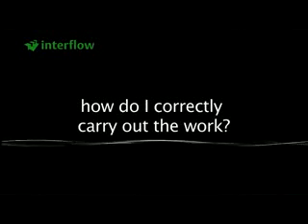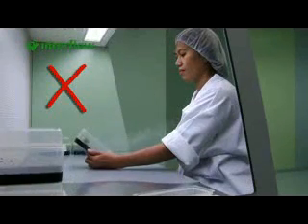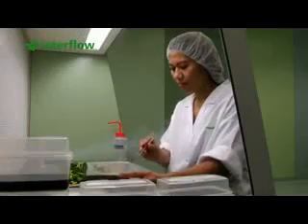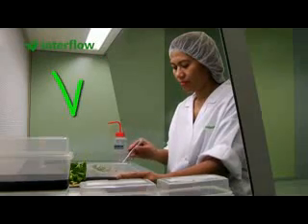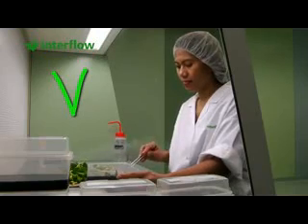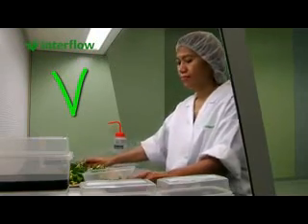How do I correctly carry out the work? When you hold the elongated trays vertically and with the opening towards you, the air flow is deflected into the tray from your skin, creating contamination of the product. It is better to hold the elongated trays horizontally and away from you, so that the air flow is obstructed as little as possible.